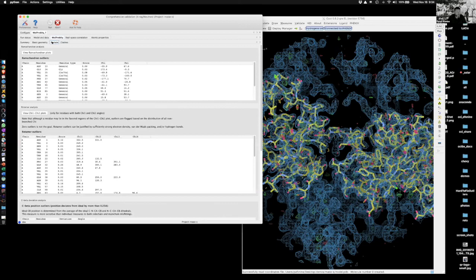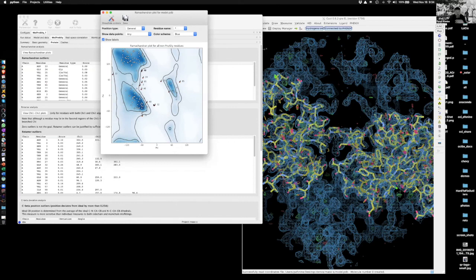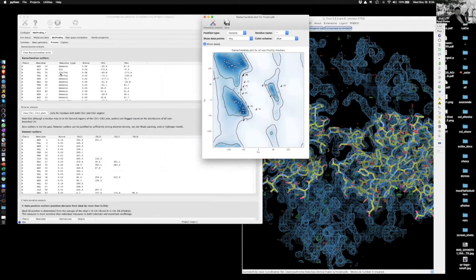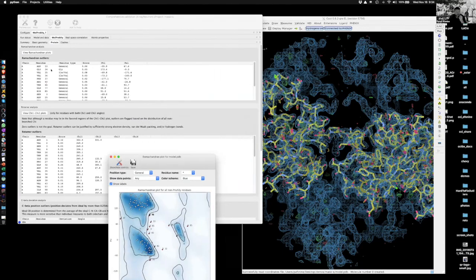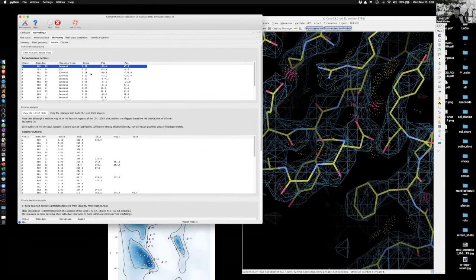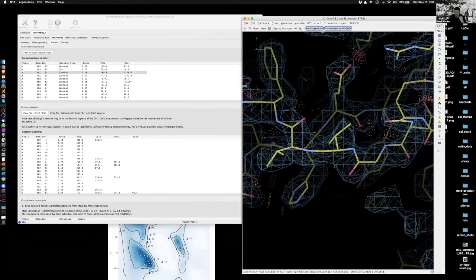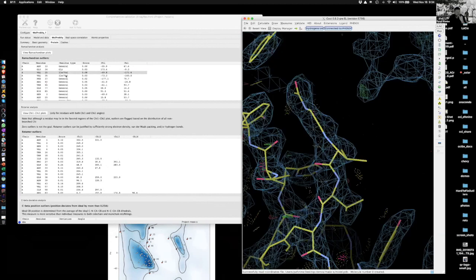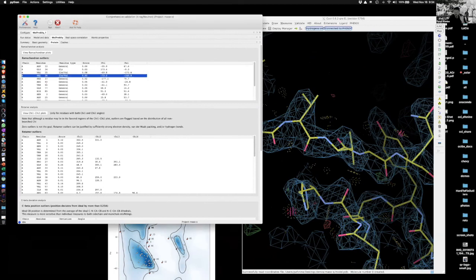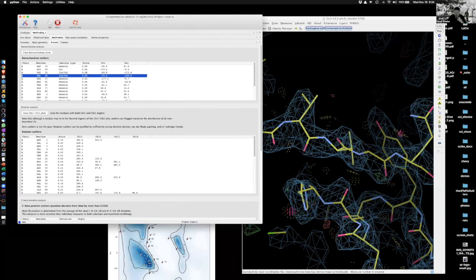You go to protein. I'm just picking randomly, but if you do it normally, go systematically through each one. Click on Ramachandran plot, and you have Ramachandran plot outliers here and here, and they're all listed in this table. They're all clickable. You can click on each one, and that will center you in Coot and the map, and hopefully you can fix them in Coot, or at least you can look at them and see what you think. Sometimes it's hard to fix them, admittedly.